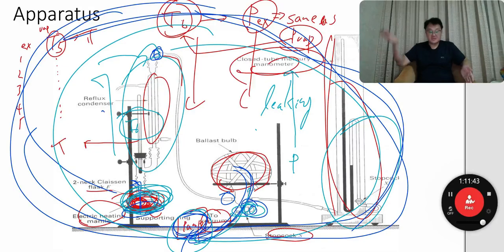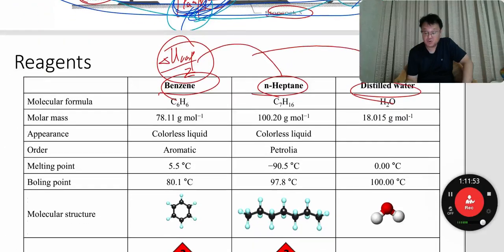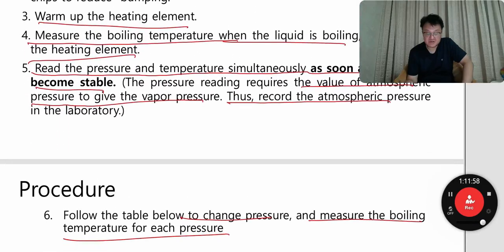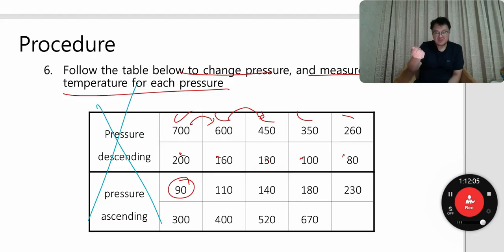with the continuous increase of the temperature and pressure, and then later on from this movie take some data points of temperature and pressure, which can be used for evaluating your data based on the Clausius-Clapeyron equation. So you don't have to do it like this, okay? In principle, you would evacuate more and then measure the boiling point, evacuate more, measure the boiling point, multiple times, but here you don't have to do it like this. And you cannot actually do this.